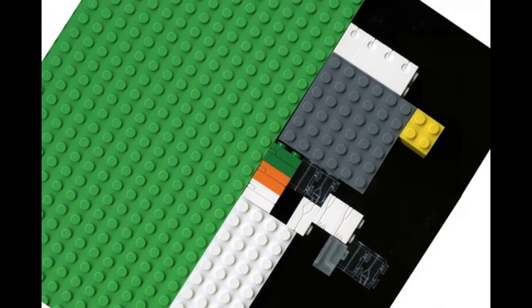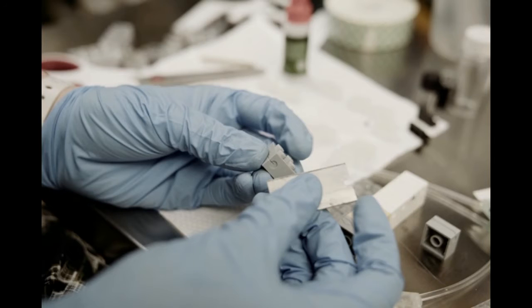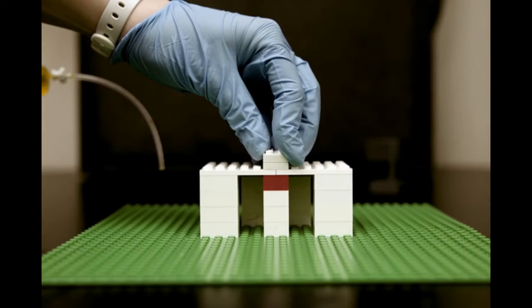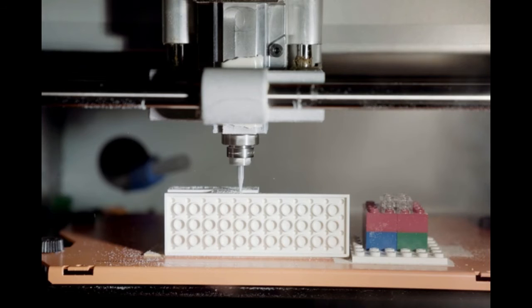Indeed, Lego bricks are manufactured so consistently that no matter where in the world they are found, any two bricks are guaranteed to line up and snap securely in place. Given this high degree of precision and consistency, the MIT researchers chose Lego bricks as the basis for a new modular microfluidic design.